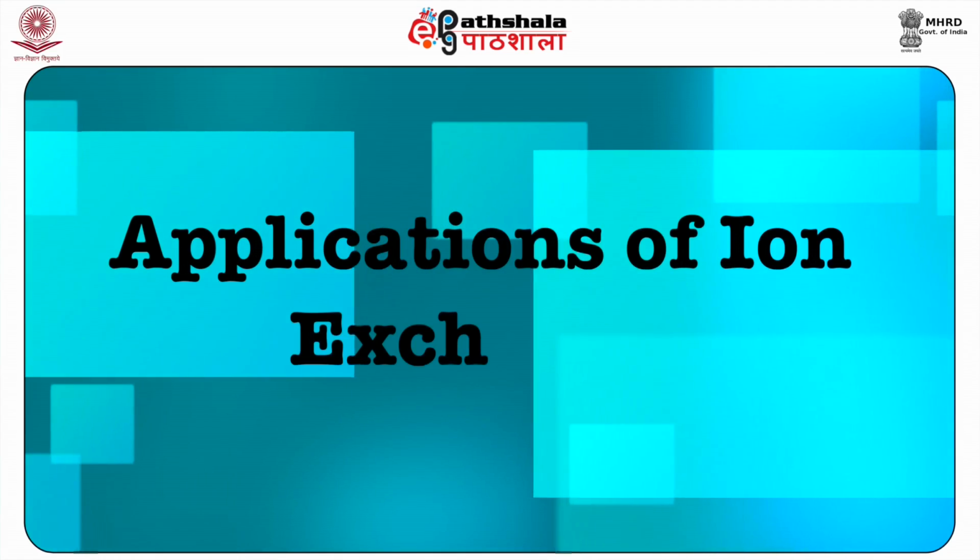Applications of ion exchange. Because of the particular selectivity forces of the material, separation with ion exchange is used. Organic ions which form salts with oppositely charged ions in another phase can be separated too. Almost all ion exchange reactions require aqueous solvents.